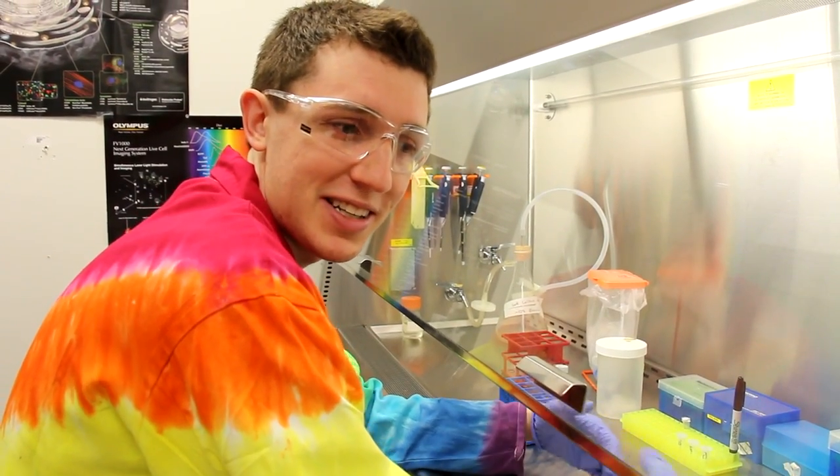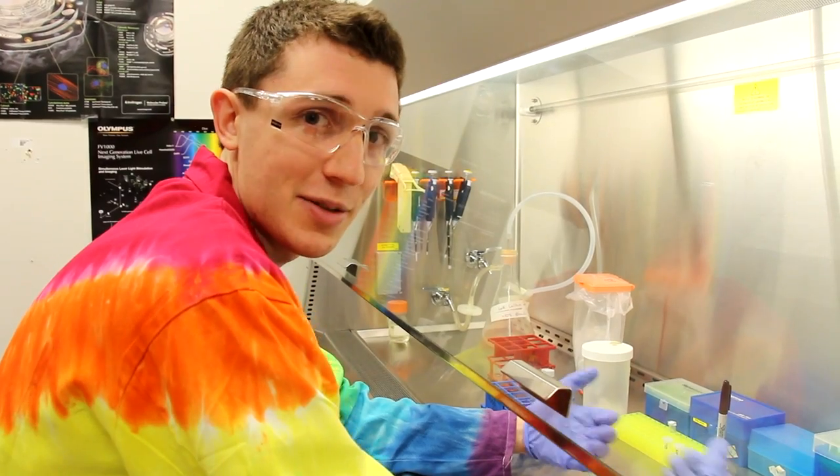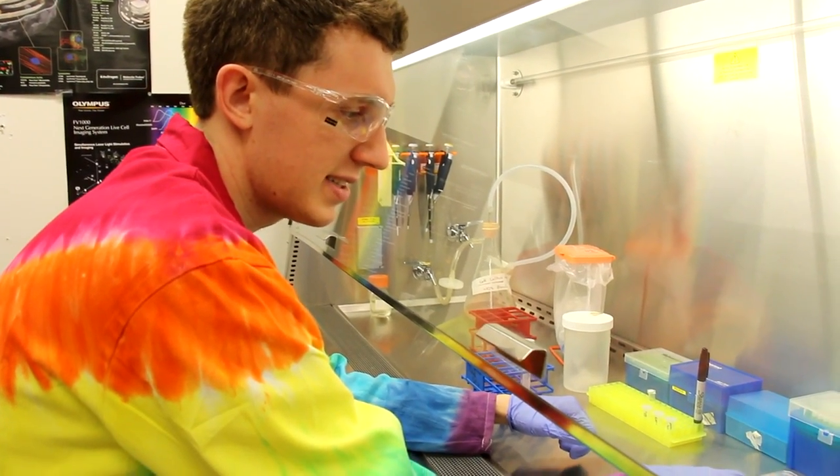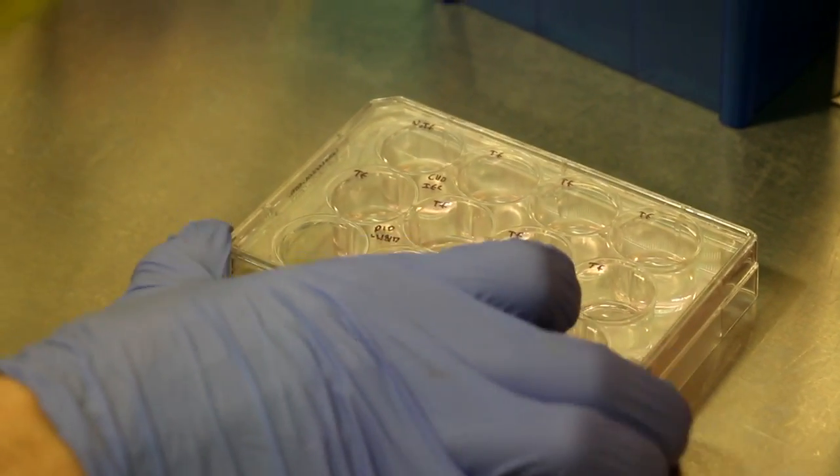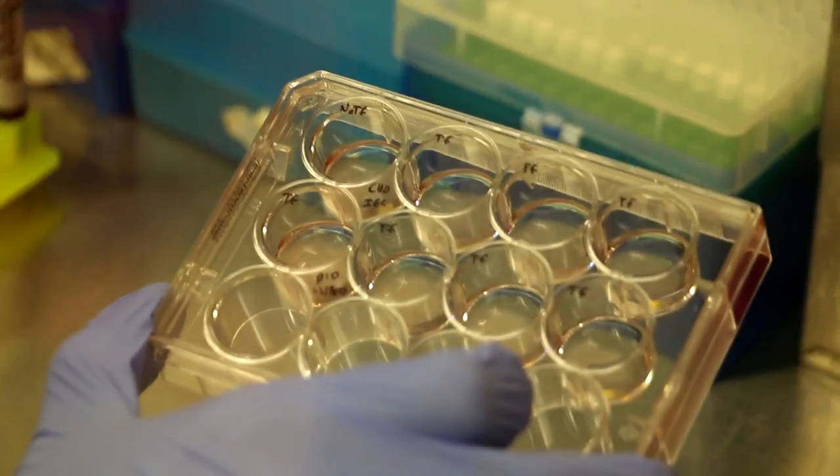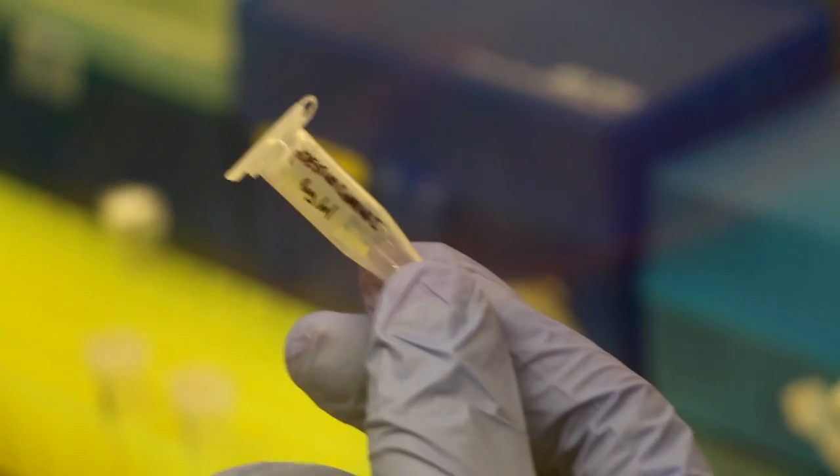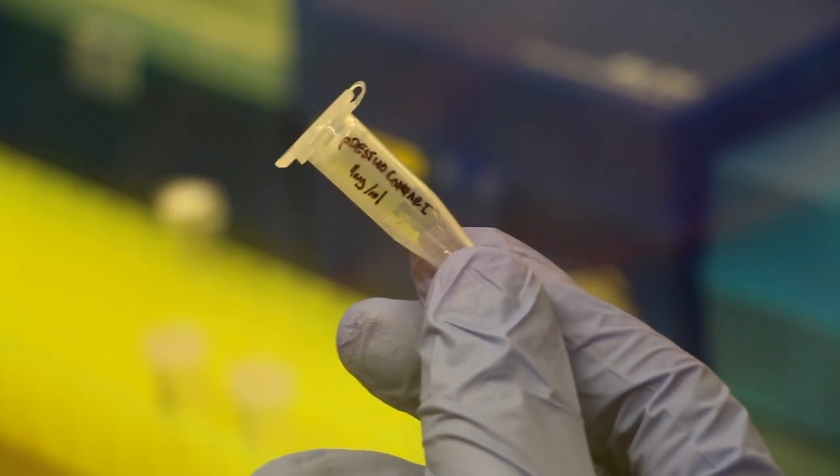Before we get started on this protocol, you're going to need to collect all the reagents necessary to perform it. The first thing you'll need is a 12-well plate containing your cells. In this case, they're Chinese hamster ovary cells. Second thing you'll need is a tube of DNA. We're using pDEST40 Campari at a concentration of 1 microgram per microliter.